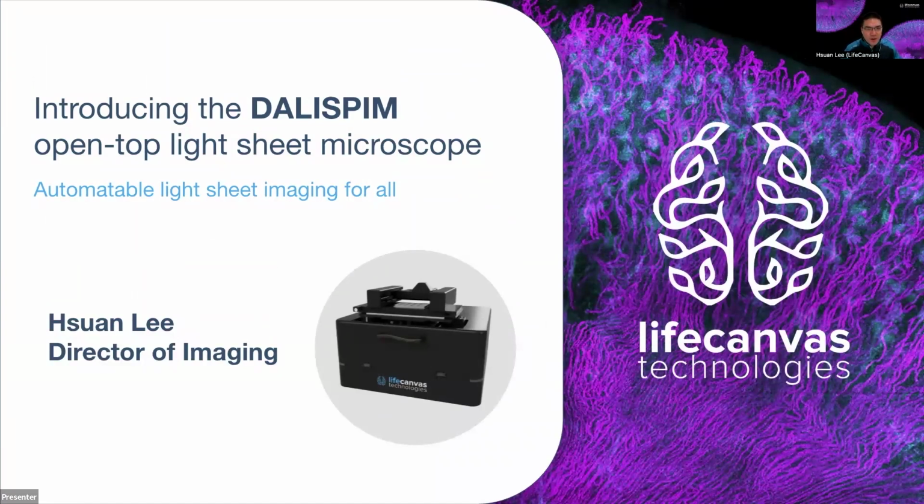So for the second part of the webinar today, I'm going to introduce the DALISPIM, a new open-top light sheet microscope that is designed for scalability and also ready for automation.